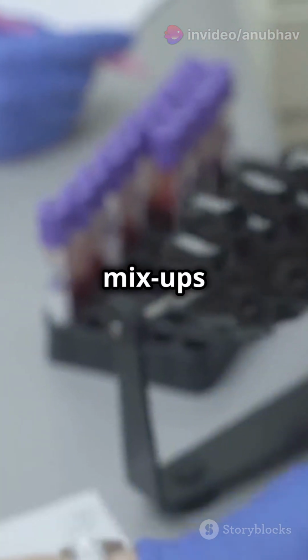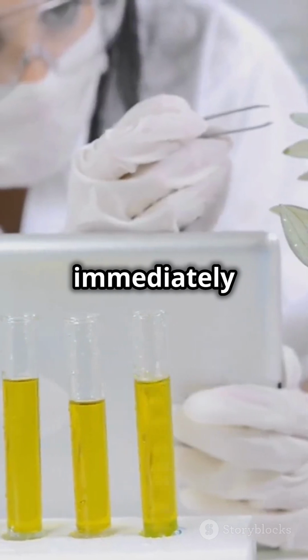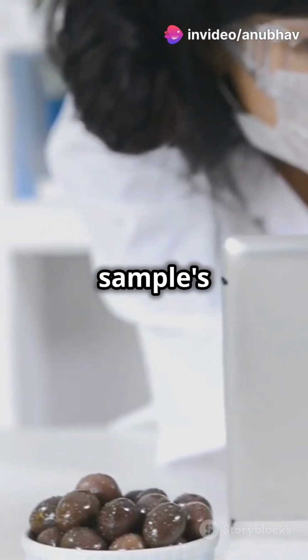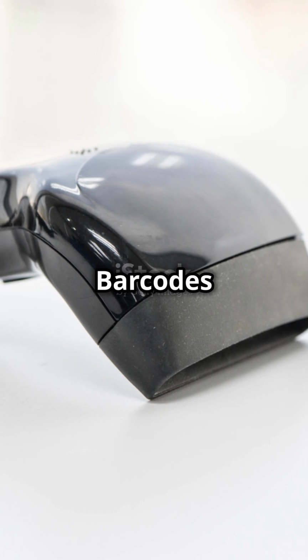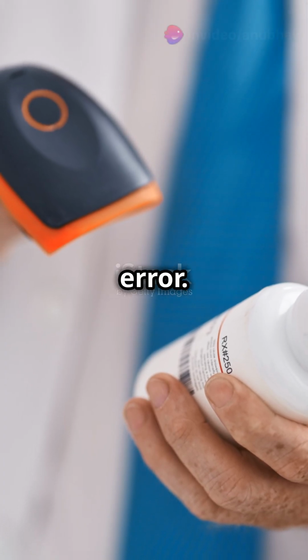This prevents any mix-ups or misidentification later on, and immediately logs into your system. This creates an initial record that can be referenced throughout the sample's life cycle. Use barcodes for efficiency and accuracy. Barcodes streamline the process and reduce the risk of human error.